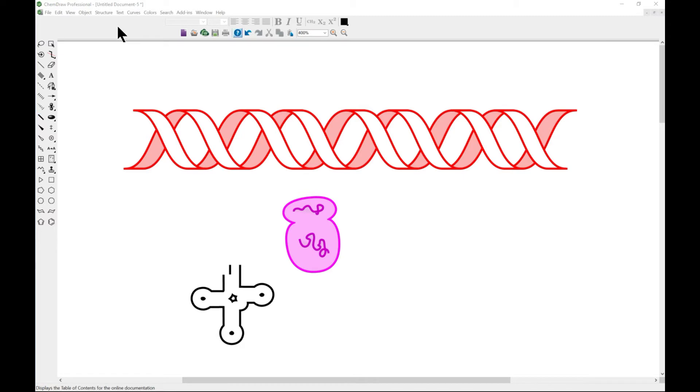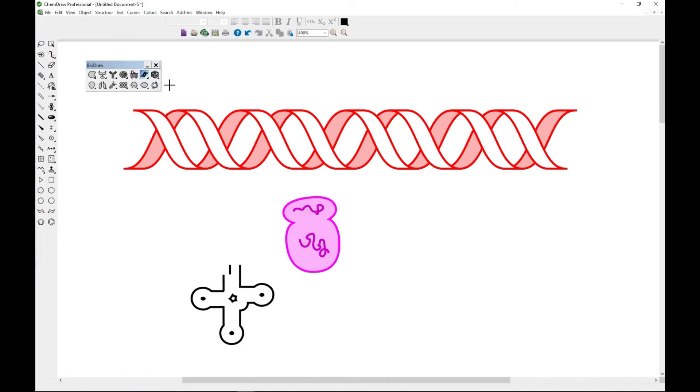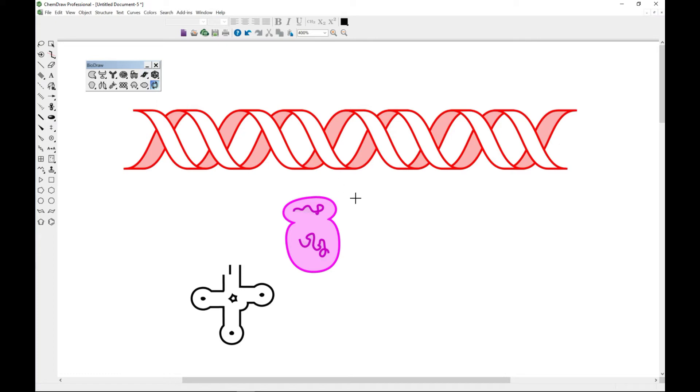The next one is plasmid map. Many people also need plasmid map, so you can come to your bio draw and you see plasmid map. You can select it and come over and draw your plasmid map.